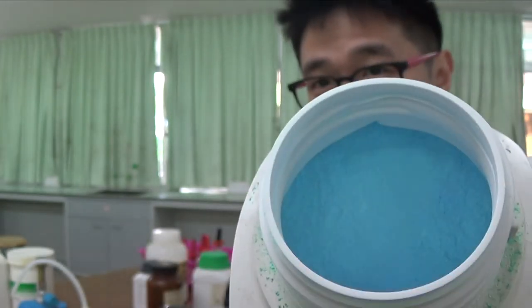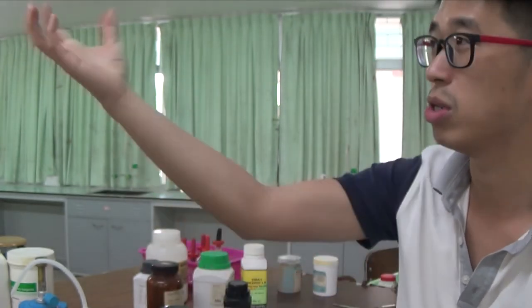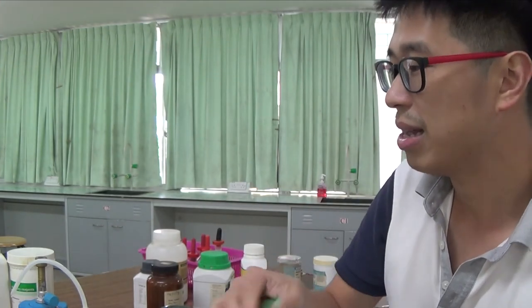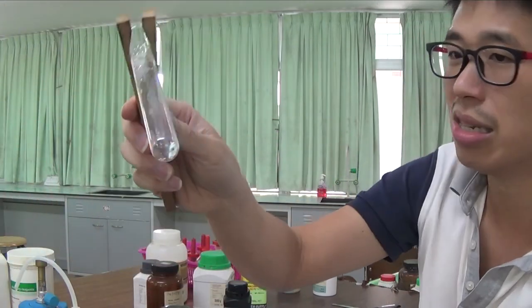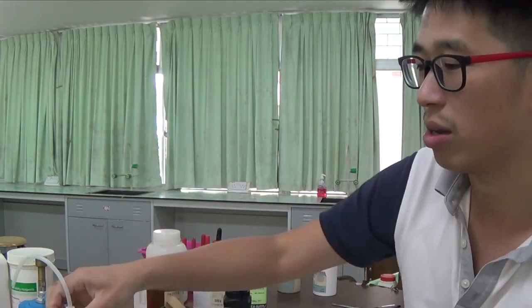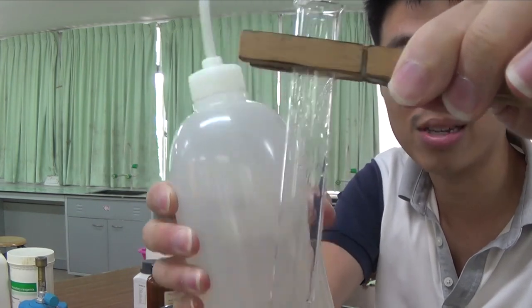It's a bit bluish, probably because this has been around for a long time, so it's absorbed a little bit of water from the atmosphere. But if it was freshly heated like this to remove the water of crystallization, it would have been white, okay? And I'm just going to add water to this anhydrous copper(II) sulfate.